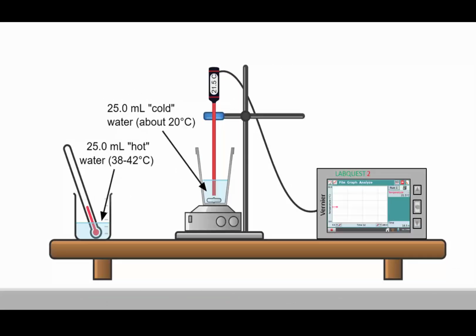In this experiment, our calorimeter essentially consists of double styrofoam cups with a styrofoam lid and the temperature sensor. The experiment begins with a calibration run to determine the heat capacity of the calorimeter. The premise in making this determination is that for any aqueous chemical process, while most of the energy is lost or gained as heat by the surrounding water solution, some of the energy is absorbed or released by the styrofoam. This quantity of energy can be related to a defined heat capacity for the calorimeter.